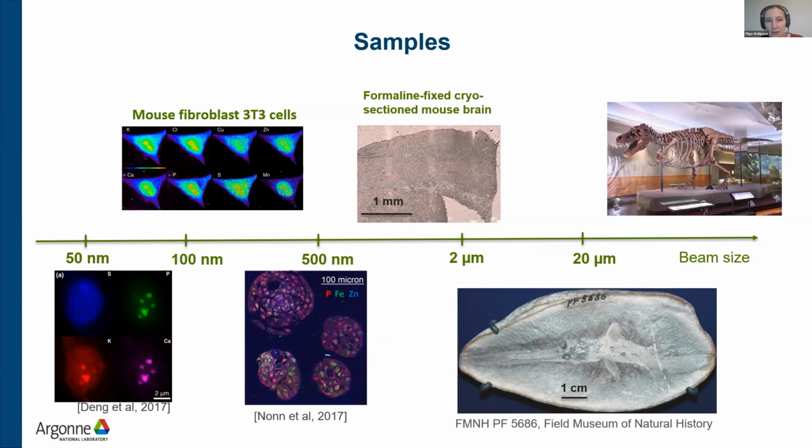And obviously for XRF, it'll be a tissue section, the thinner the better. And we can go to even bigger samples like leaves or wood chunks using XRF, microscopy, and micro-CT. And sometimes we even expand the time scale to something which happened a long, long time ago and study fossils. Sometimes we can go as big as T-Rex, not at once though, but like at some bone fragments.